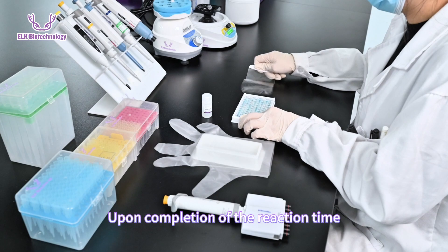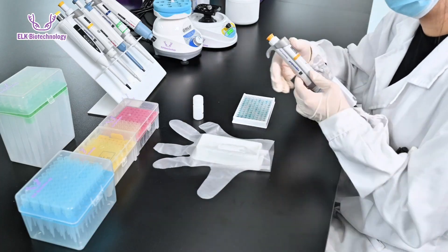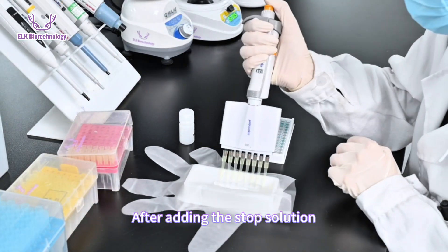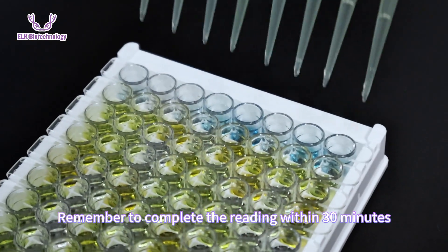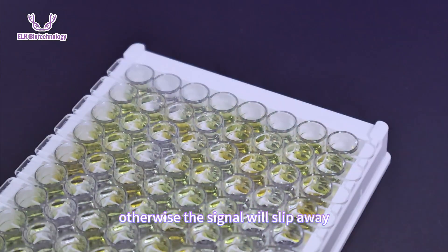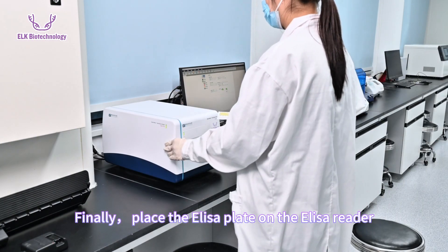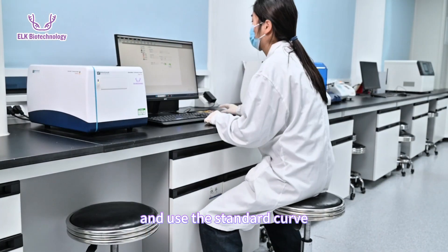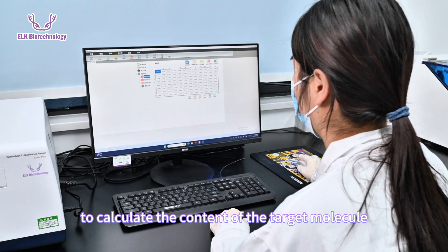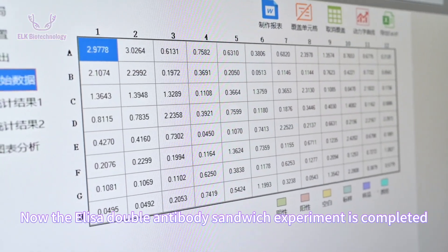Upon completion of the reaction time, add the stop solution to stop the color reaction. After adding the stop solution, the blue color instantly turns into a deep bright yellow. Remember to complete the reading within 30 minutes, otherwise the signal will decay. Finally, place the ELISA plate on the reader, read the absorbance value, and use the standard curve to calculate the content of the target molecule in the sample. The ELISA double antibody sandwich experiment is now completed.